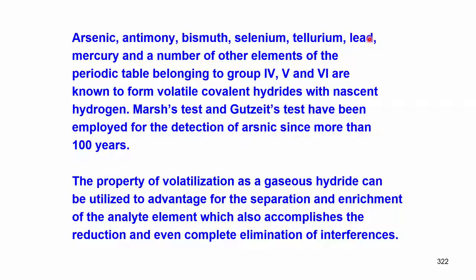These are known to form volatile covalent hydrides with nascent hydrogen. That means, we have to generate nascent hydrogen in the solution along with these metals.